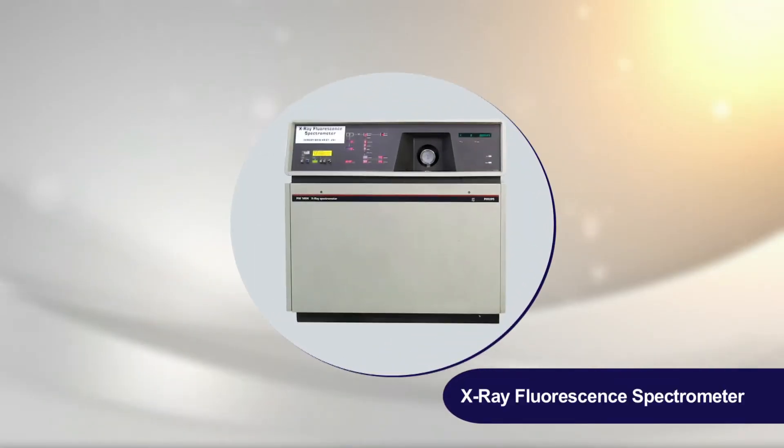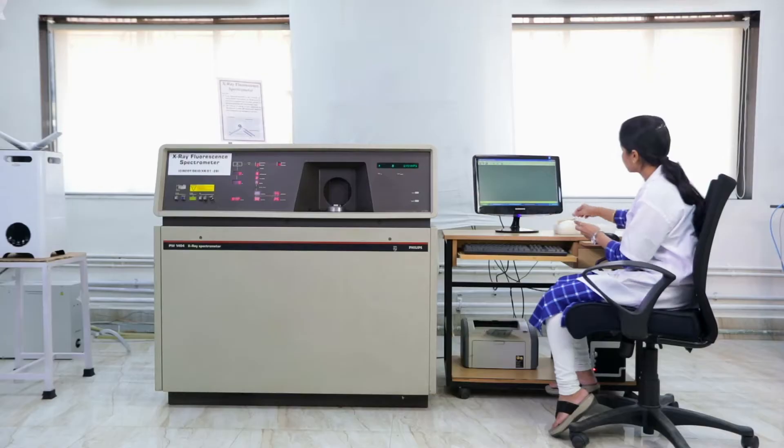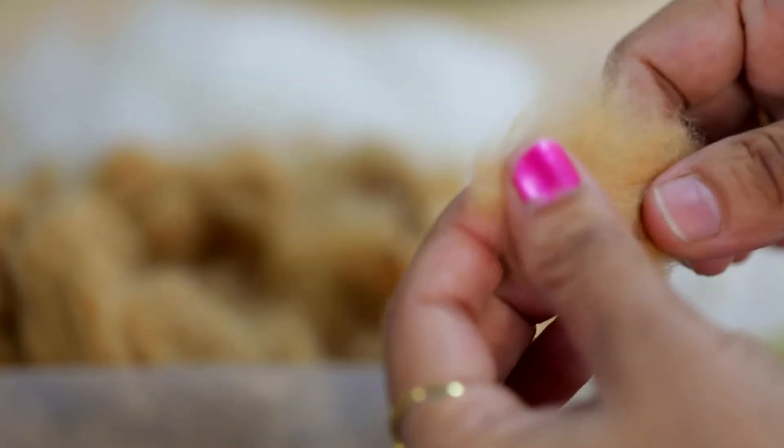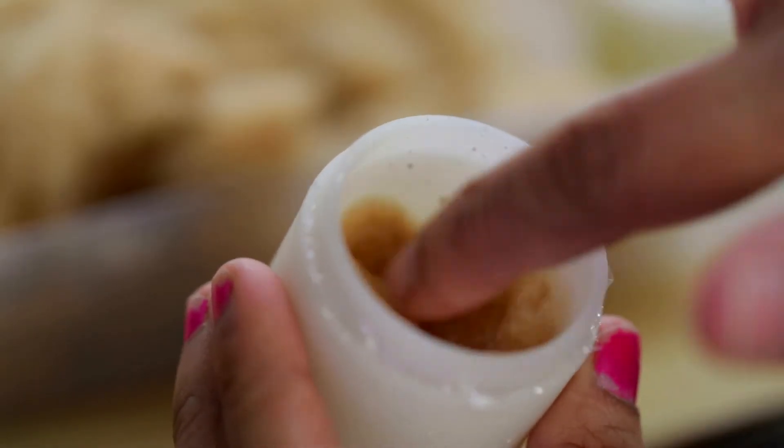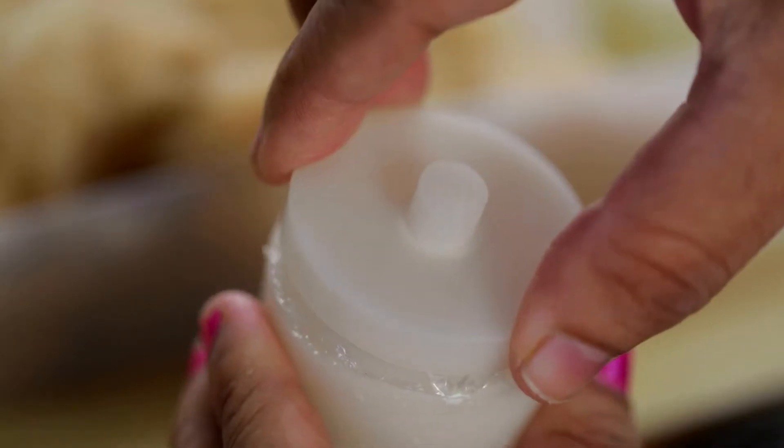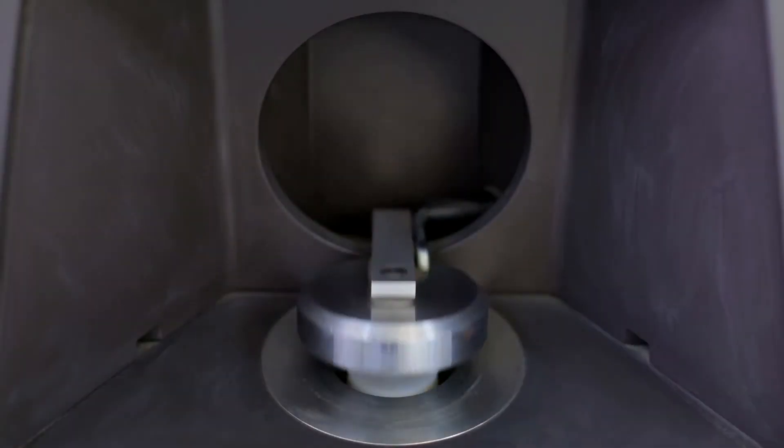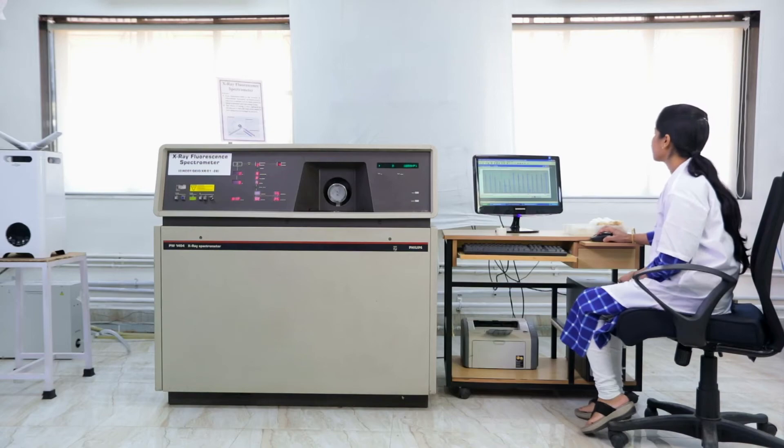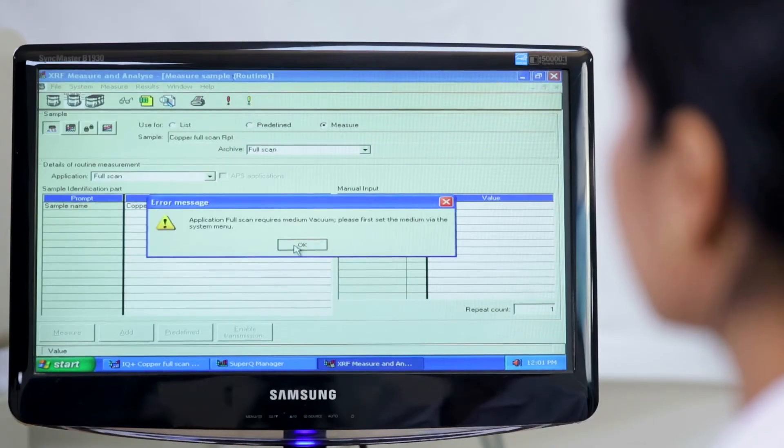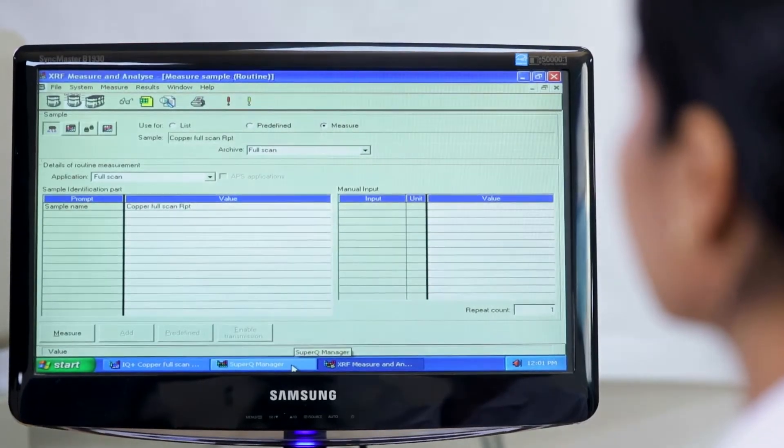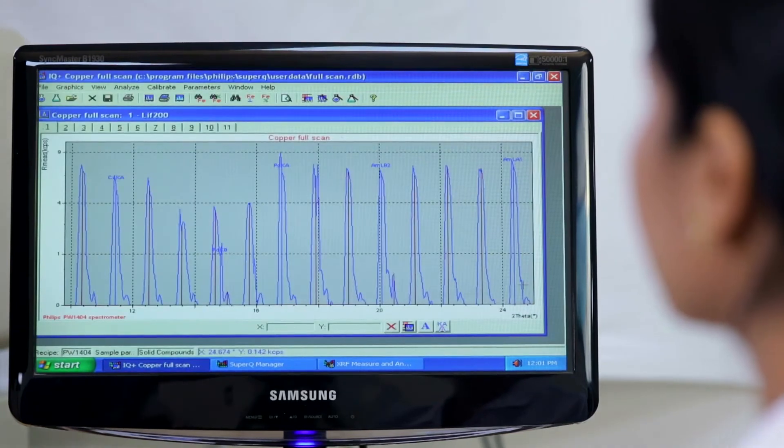The X-ray fluorescence spectrometer is an instrument widely used for relatively non-destructive elemental and chemical analysis of different materials. The relative ease and low cost of sample preparation and the stability and ease of use of XRFS make this one of the most widely used methods for quantitative analysis of trace elements in a wide range of applications.